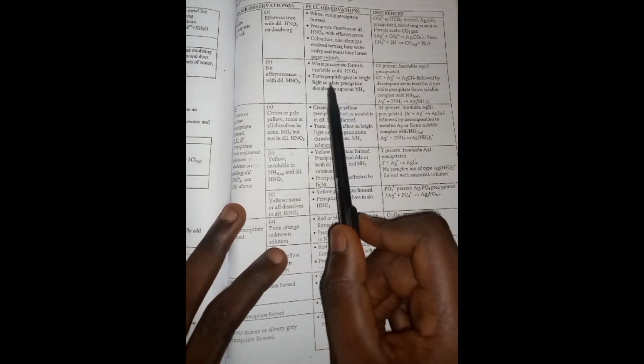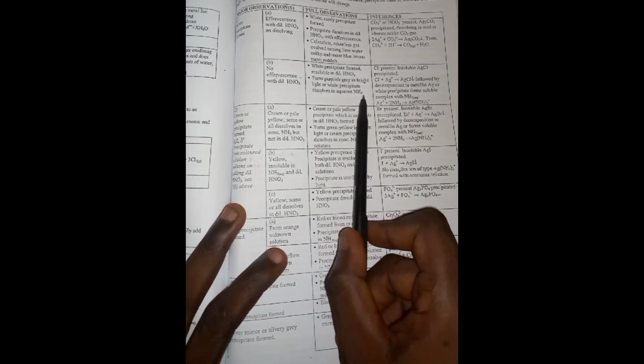Then the next question might want you to carry out another test that is shown by only chloride ions. In this case, let's assume that we added but excess ammonia, right? Excess ammonia. Good. You see that it is going to turn purplish gray in bright light, or the white precipitate dissolves in that. But if we're adding nitric acid, therefore we're going to have this. So our advice is that you write all of this, to copy all of this.